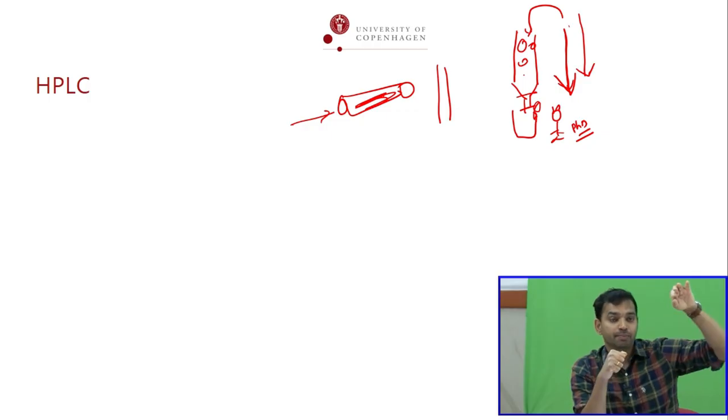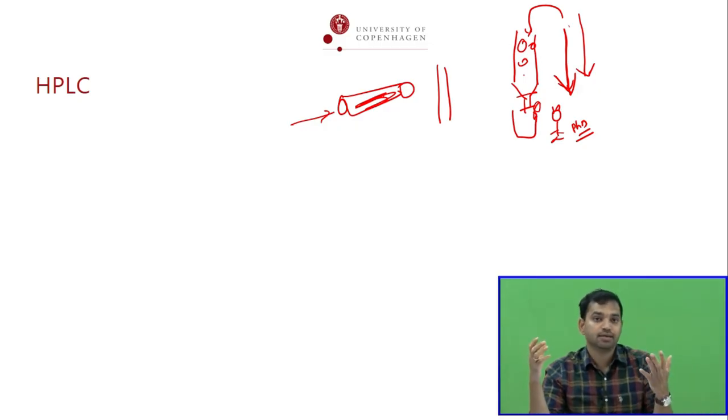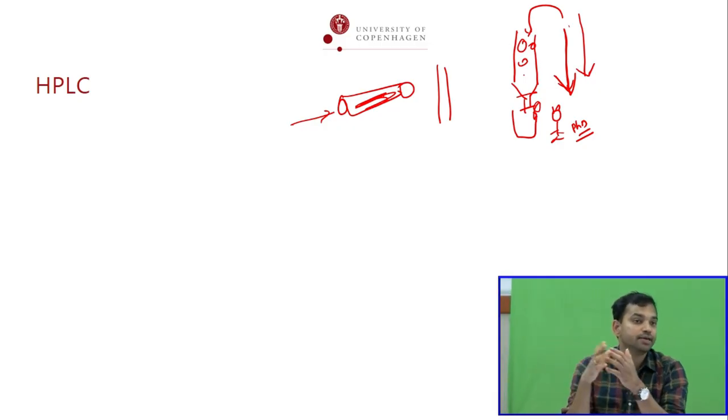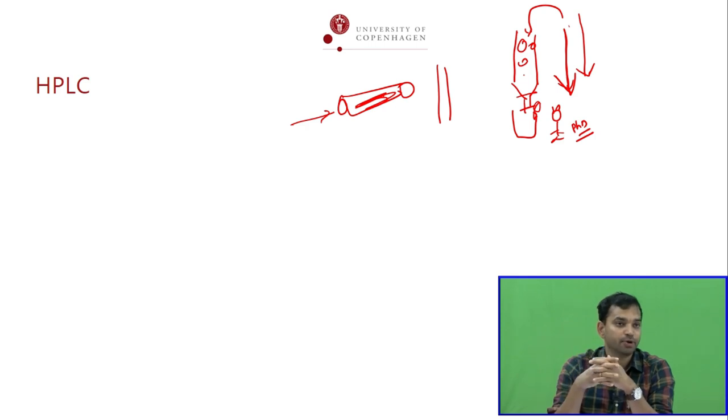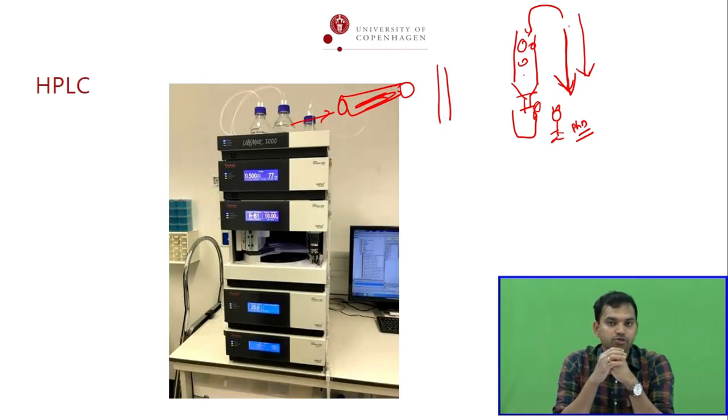You can get a very high pressure depending on the type of packing, length of the column, and the viscosity of the solvent. The pressure can rise 300 bar, 400 bar, 1000 bar, 1500 bar, and so on. It's extremely high pressure I'm talking about. To handle that pressure, to create that pressure, we need an equipment that is called HPLC. It's also called high pressure simply because it handles so much pressure. It's also called high performance because now nothing is manual. Things can be made more automated. So that's called high performance. Is it clear? Right? The column chromatograph.